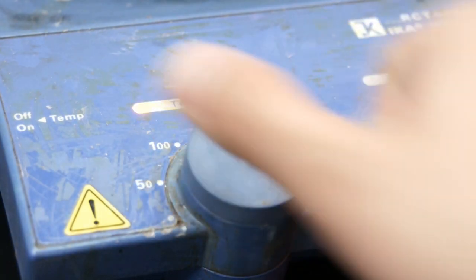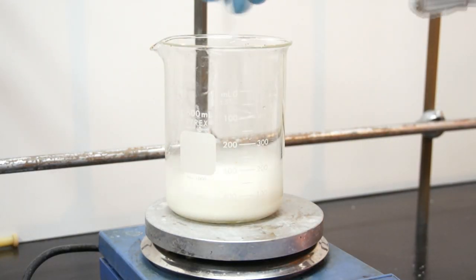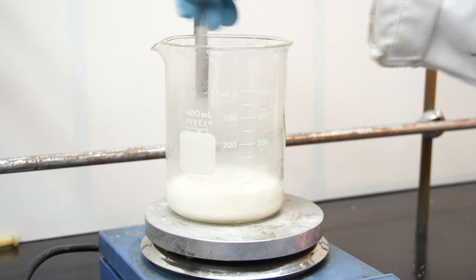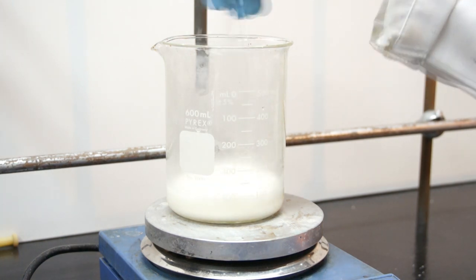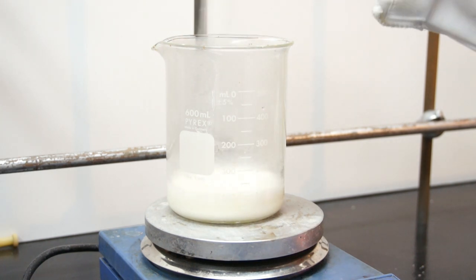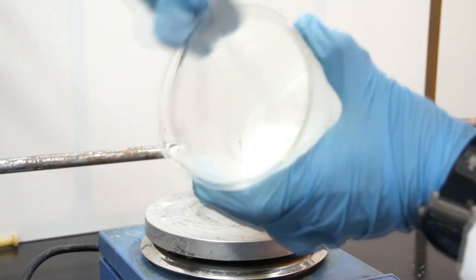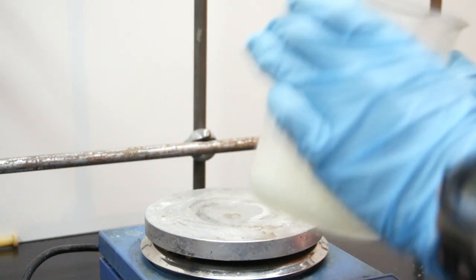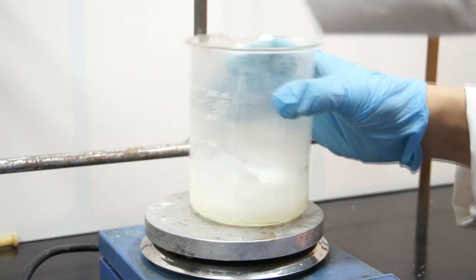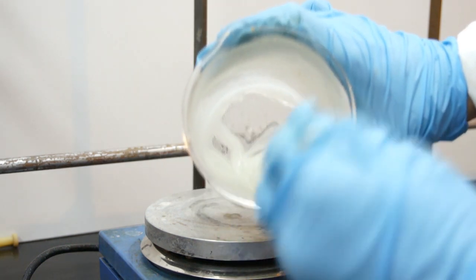Now turn on your heat and start stirring like crazy. What's the chemistry actually happening inside that beaker? Well, starches are polysaccharides, or large branched polymer chains consisting of sugar molecules. As you heat the mixture, the acetic acid hydrolyzes, or breaks the bonds between the branches, and this leaves you with long linear chains of polysaccharides, or sugars. Ordinarily these linear chains are fairly stiff, but because we added glycerin, this acts as a plasticizer, enabling the plastic to be somewhat flexible and not brittle.